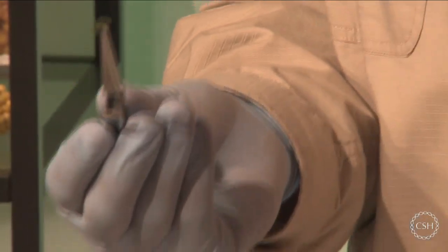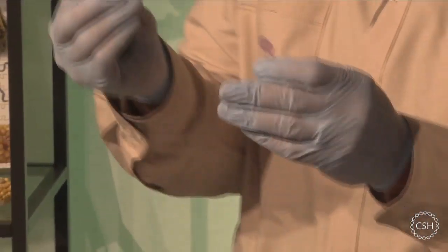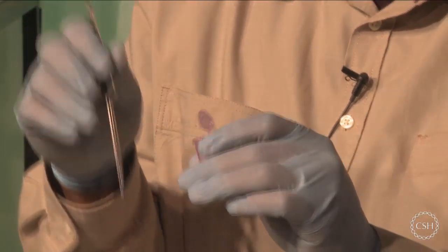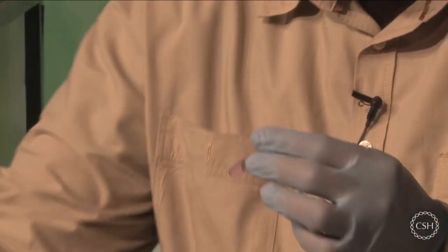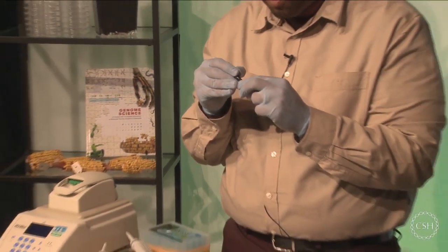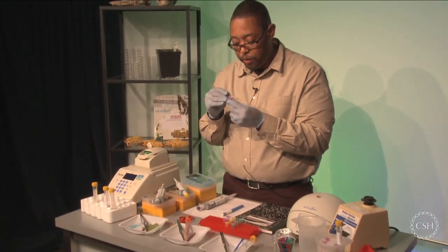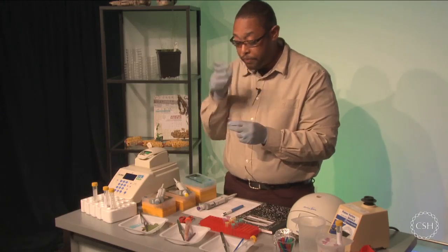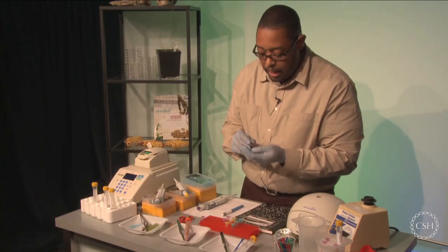So I'm going to take one of my test tubes now, and I'm going to add my tissue. Okay? So my tissue is now in that test tube. I can put my forceps down, and now I can label this individual test tube. This will be sample number 1. Make sure you label the top and the side, and also that it is a plant. Okay? So here's sample number 1.